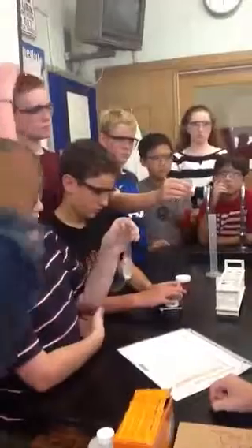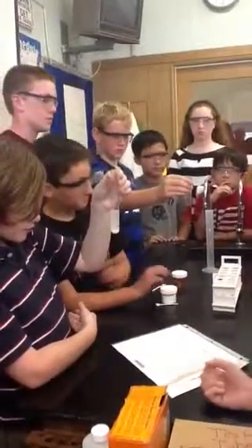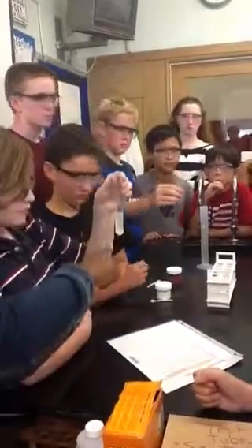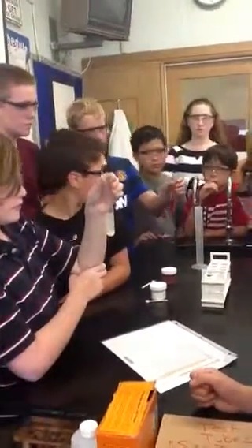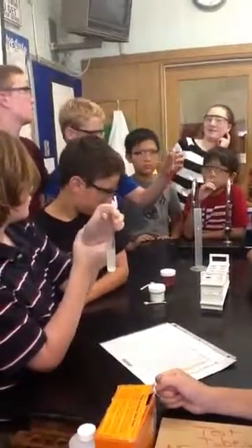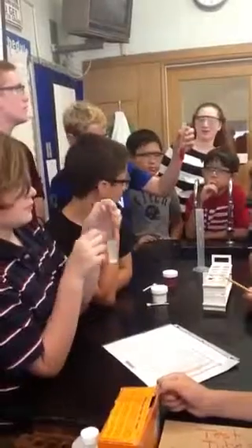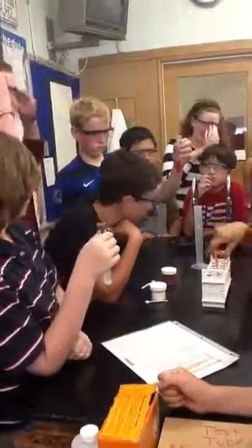All right, so what would you say about the red substance? We said that this is immiscible, or does not mix well. What would you say about the red? Jessica? Miscible, which means it mixed really well. Okay. Thank you.